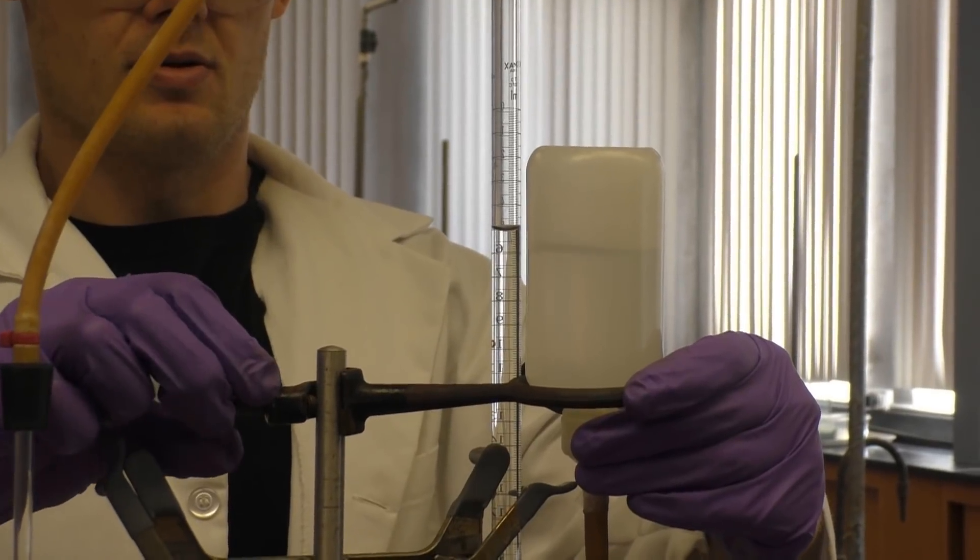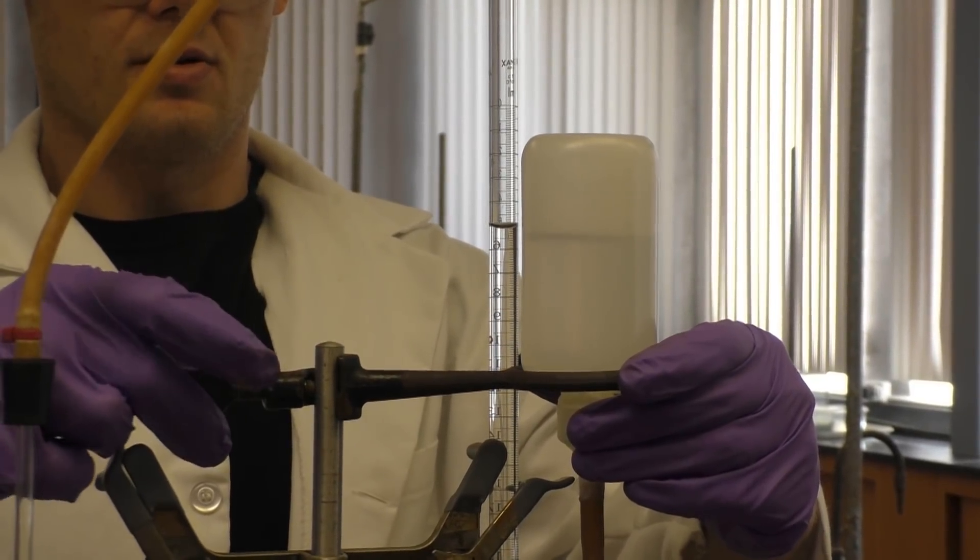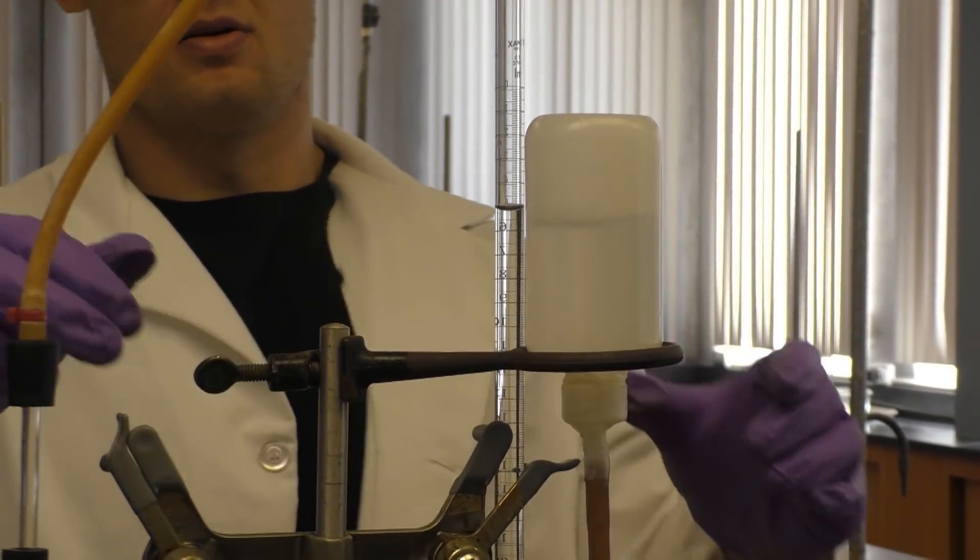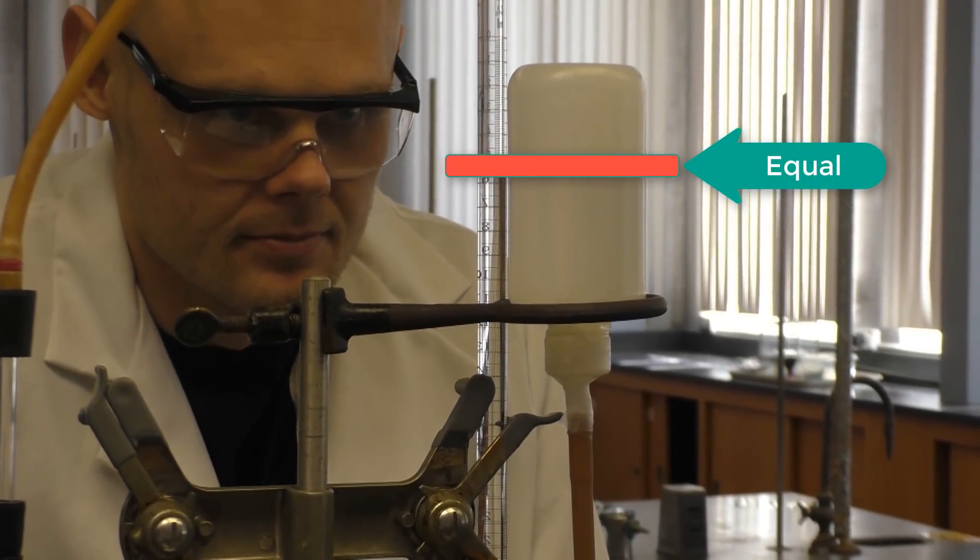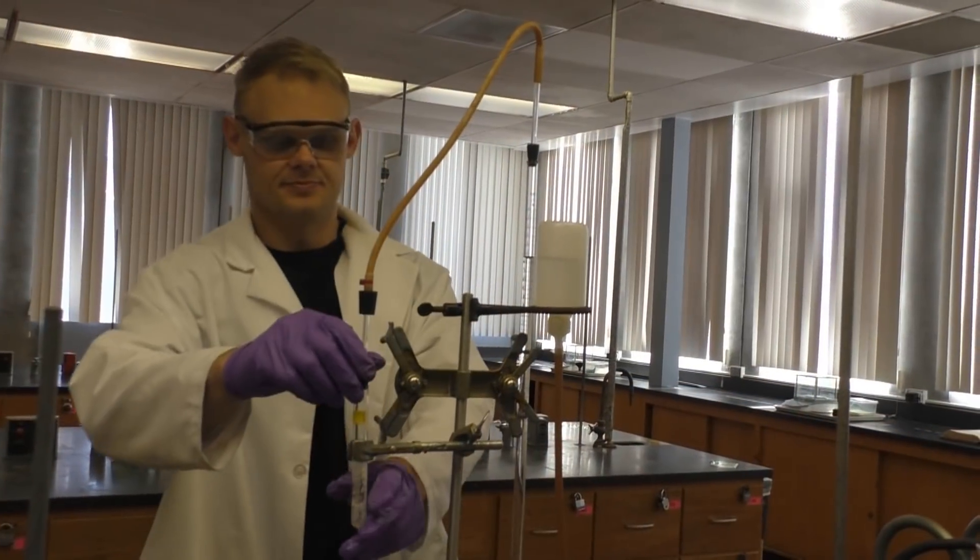You now must equalize the pressures again before you obtain your final volume reading. Thus, just lower your leveling bulb until its water level is equal to that in the burette and then write down the volume of the water in the burette to two decimal places.